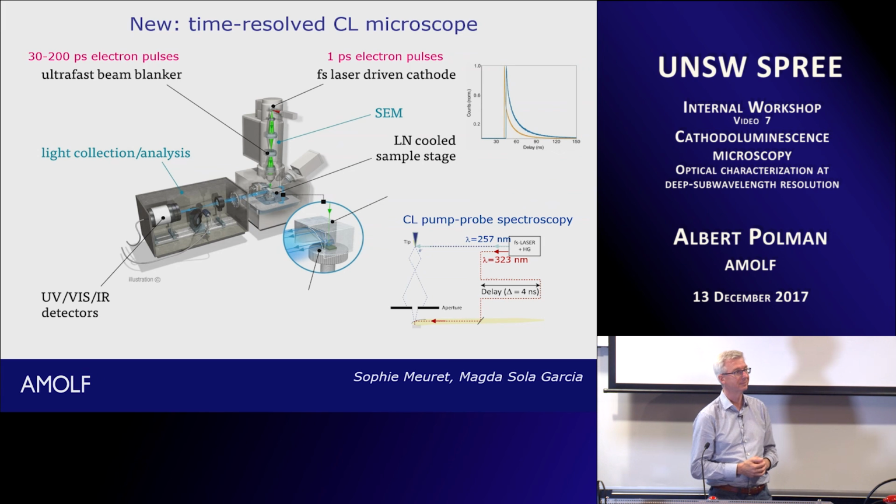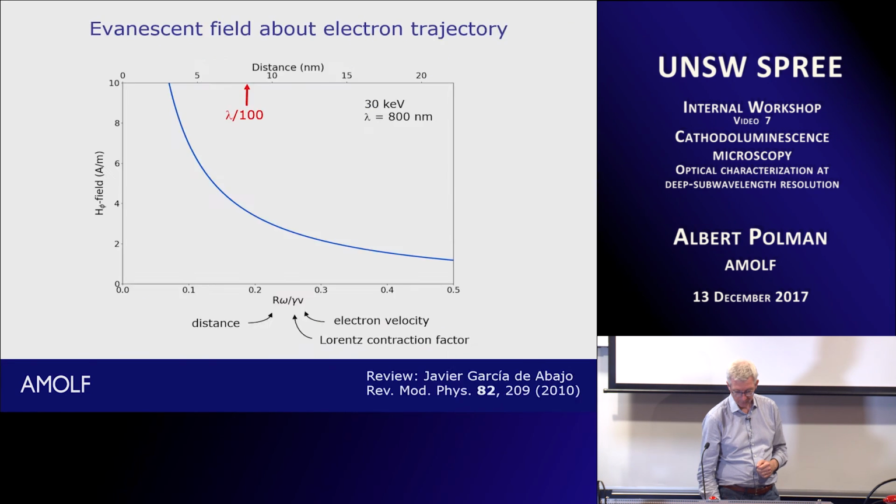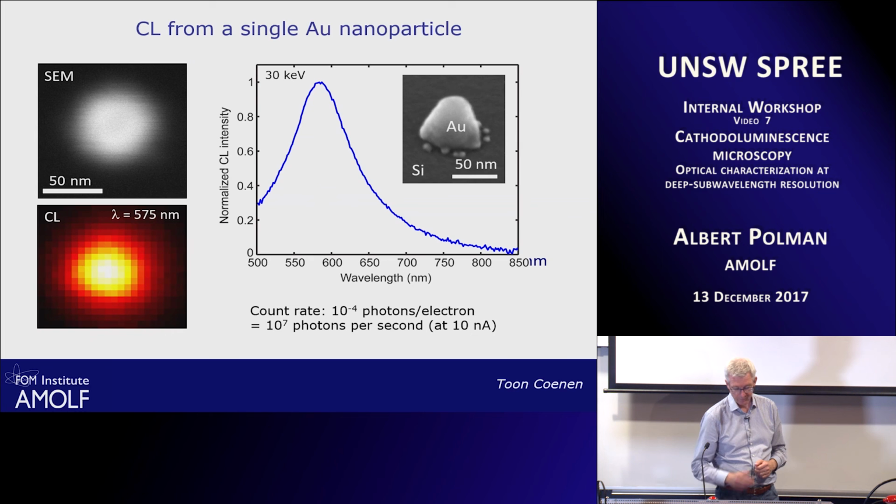Thank you. That's remarkable what you can do with an electron microscope and a spectrometer. I wondered if you could elaborate a little bit on the coherent mechanism, because you gave us this very clear picture of the electron approaching the surface, and which is then the dipole. What I immediately thought was, okay, this could be very broadband, and I think that was what you were saying. But then you showed us plasmon emission, where I guess that's the only mode that couples efficiently into free space. But when I just have a planar surface, am I really getting white light off that planar surface?